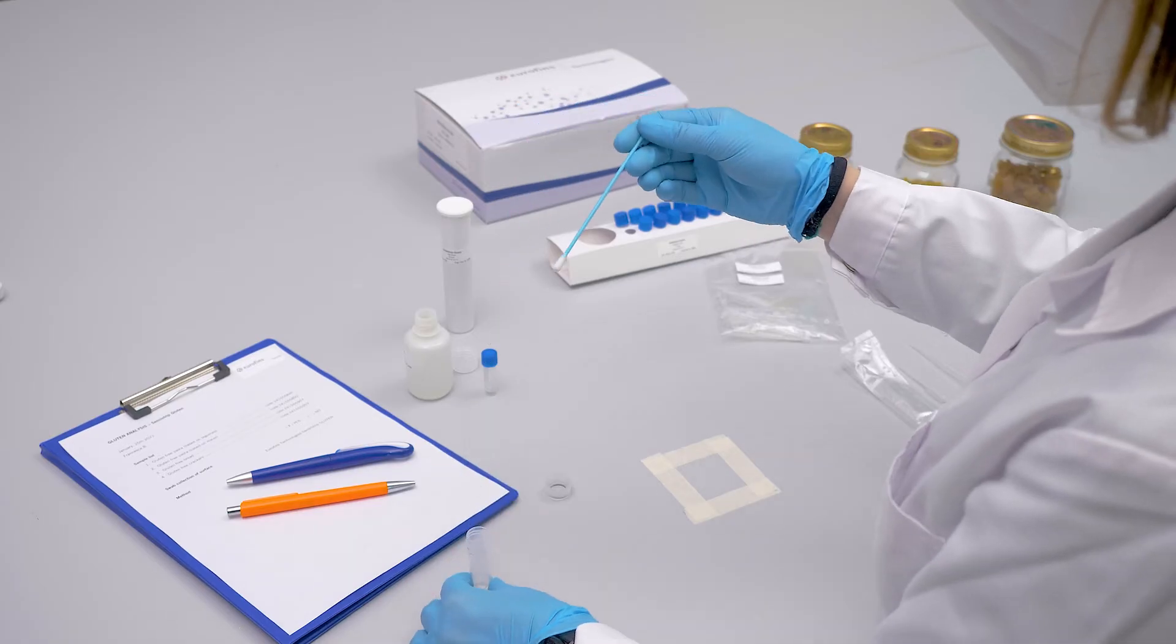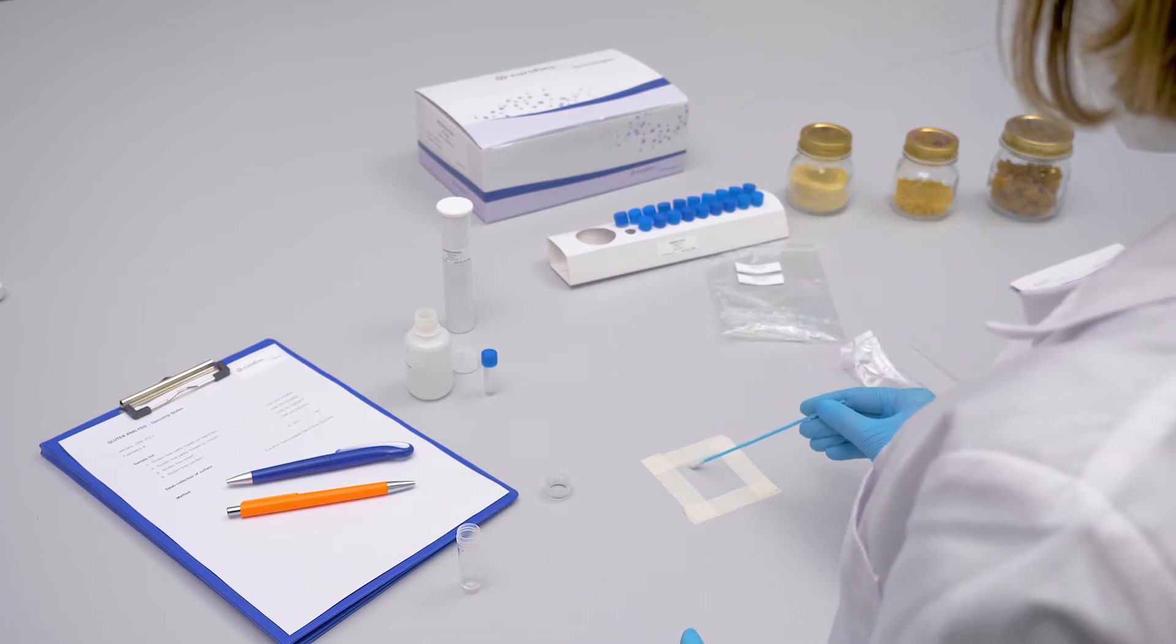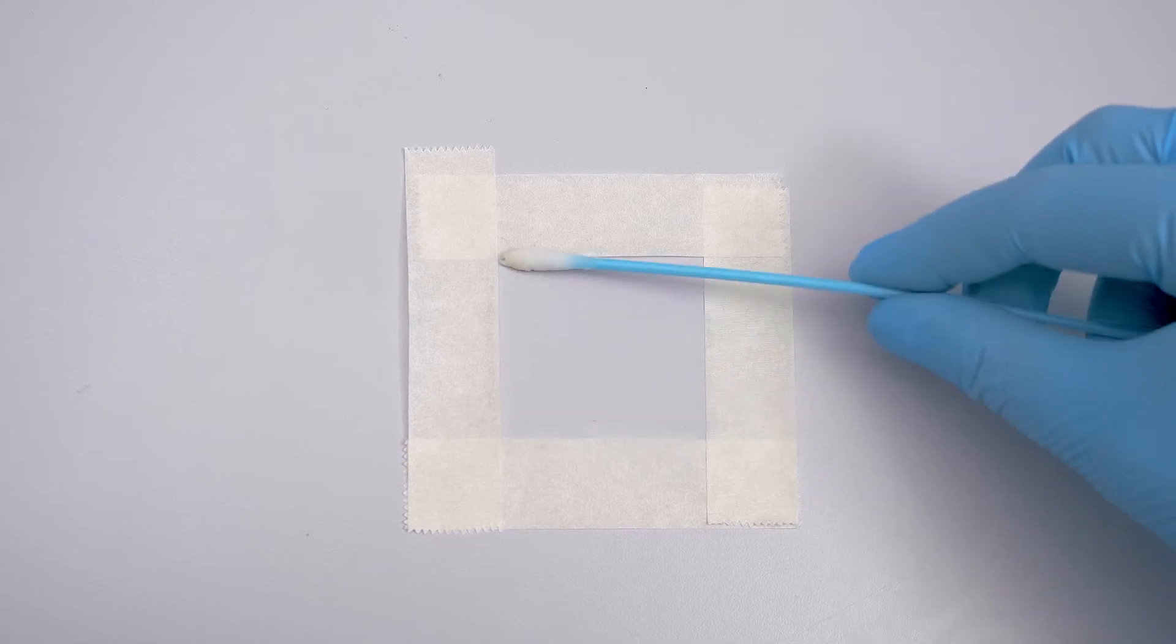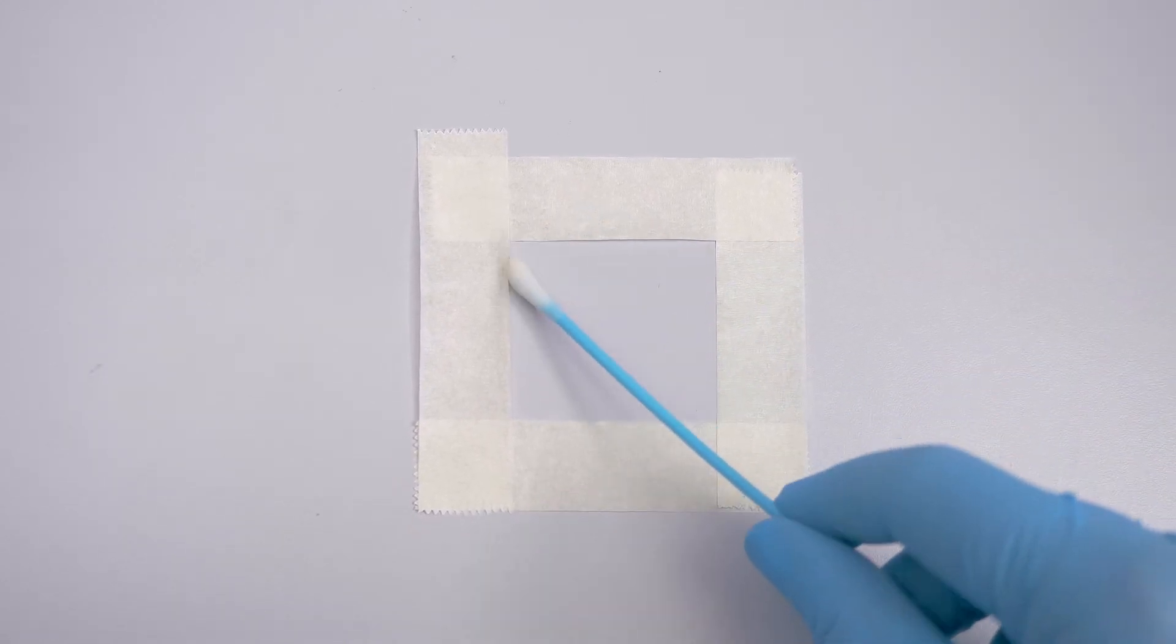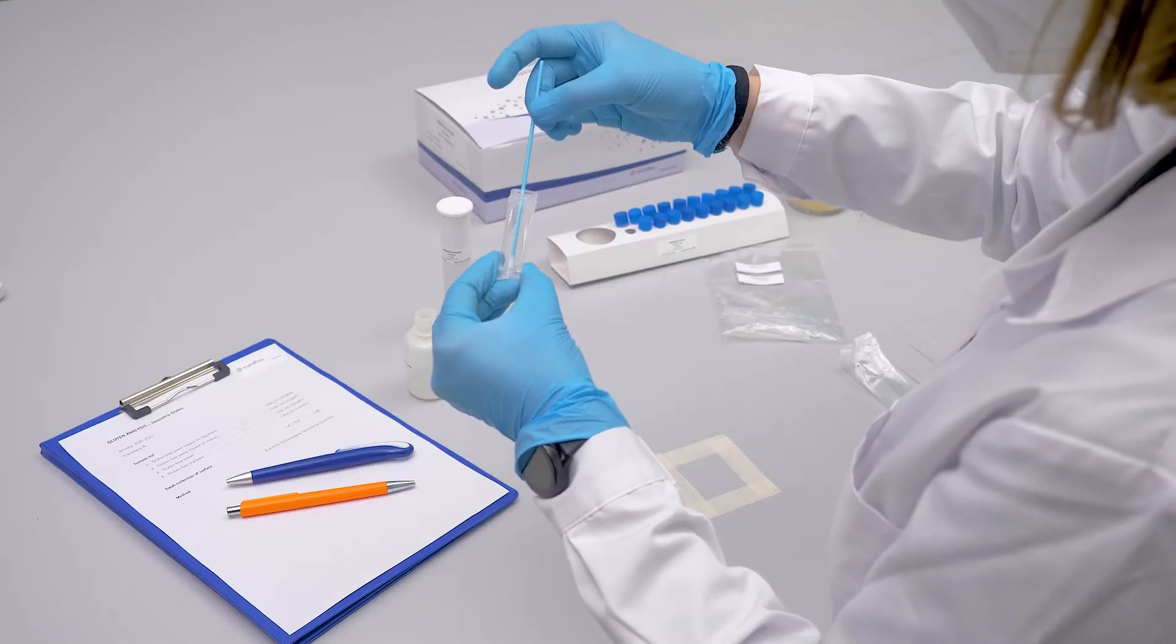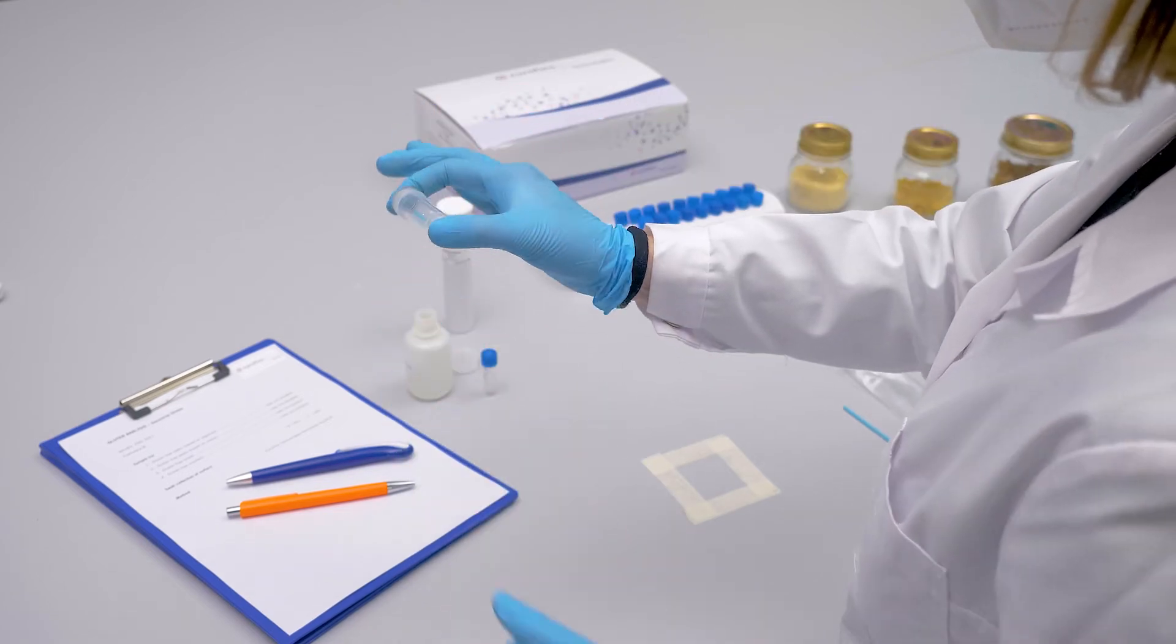For effective sampling, it is recommended to rub the swab on the surface in three directions: horizontal, vertical, and diagonal, rotating the tip of the swab. Insert the swab into the extraction tube, break it into the tube and then close it.